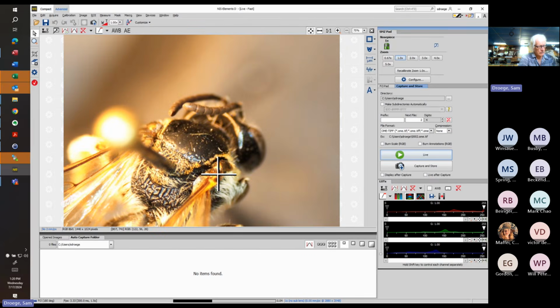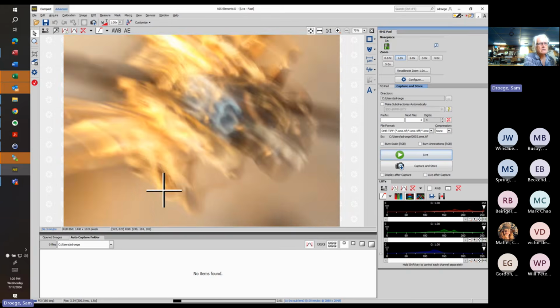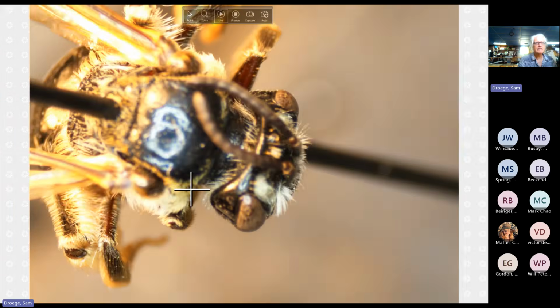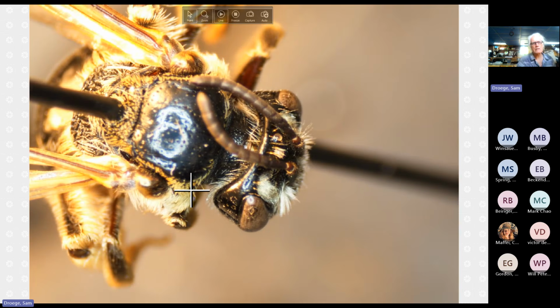We said the vertex is short, look at the very broad spacing on these carina, those cells that are made by the raised lines. Let's take a look at that and bring that into view. I can do Control F to get us a full screen on this. And indeed, we have a good shot here. There's a piece of dirt in the viewfinder. Dirt's right there. There's the ocelli.